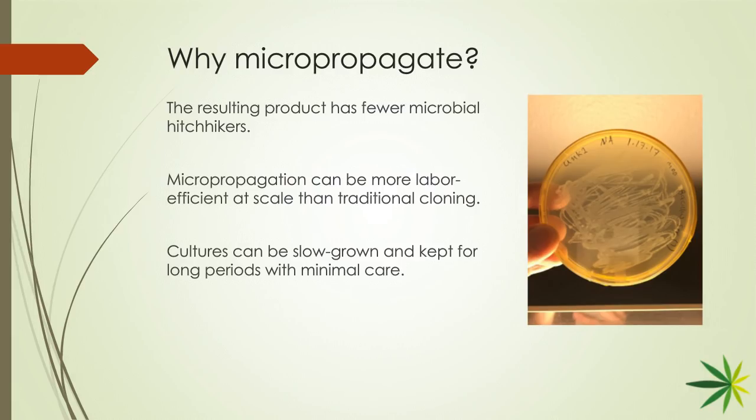And then explain why it's good that these cultures can be slow grown and kept for long periods with minimal care. I know the answer, but I want you to tell our audience the value behind this type of methodology, without really having to have mother stock, in that mindset.